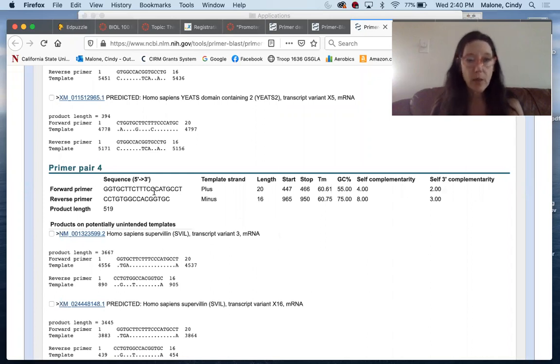So here we are again. Remember, it was 20 and 16. This is where it starts and stops. So that's on the 5' side. And this is on the 3' side. So 65, that's pretty close to the end, that's 69. So it's got to be sitting there kind of like the primer that we made in class. GC rich, that's crazy, but the melting temperatures, that calculation ends up being very similar. So that should be good for PCR.